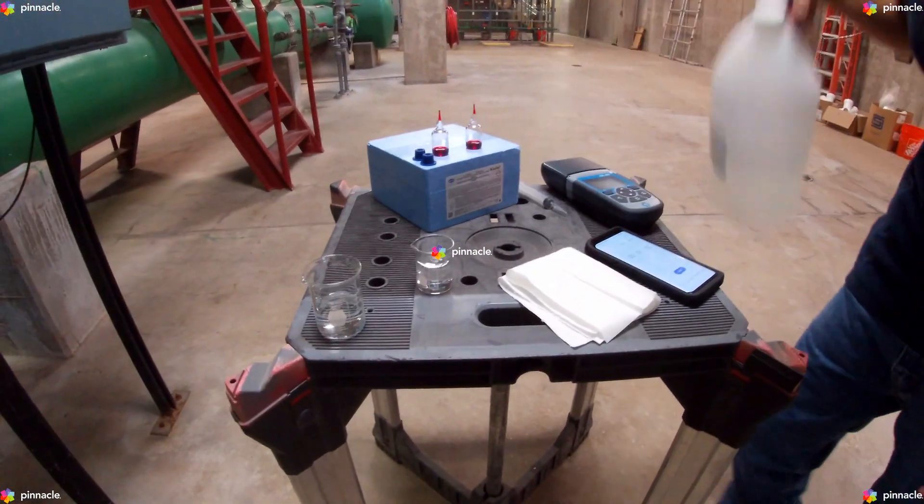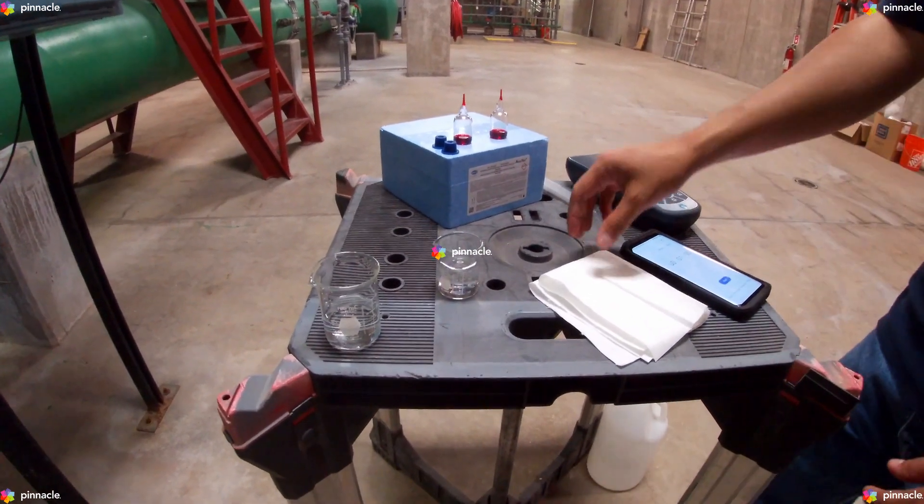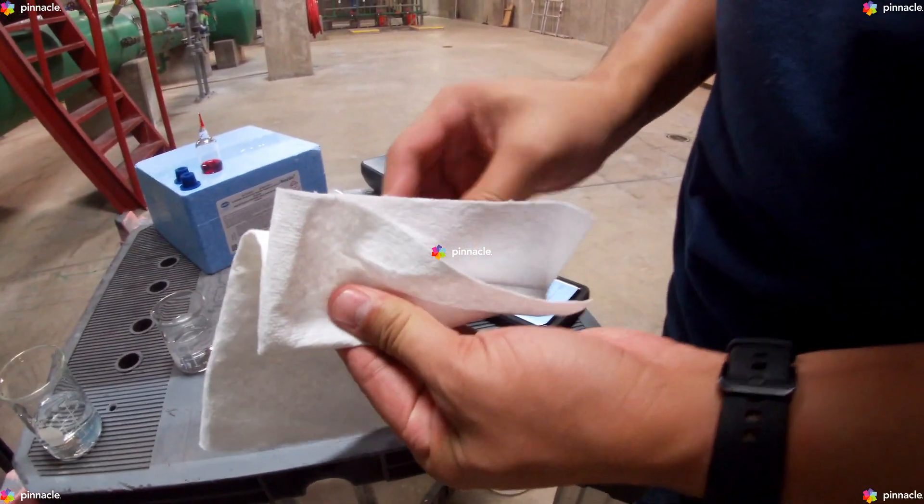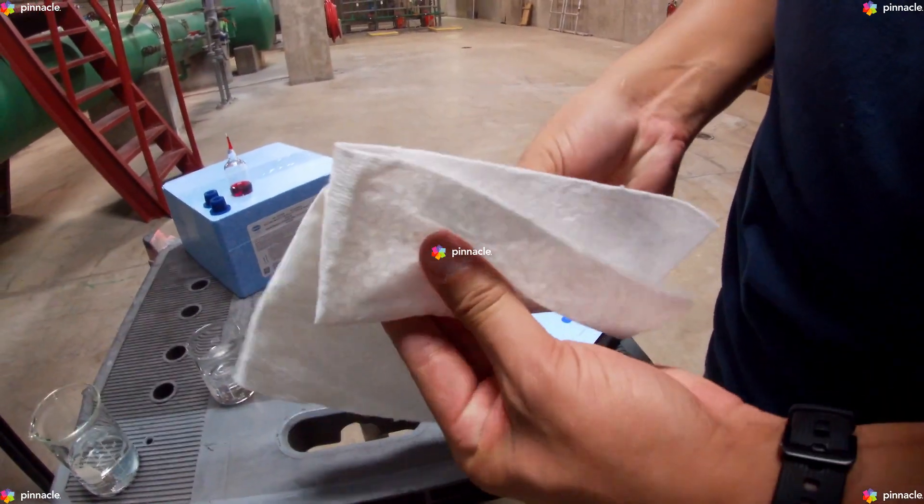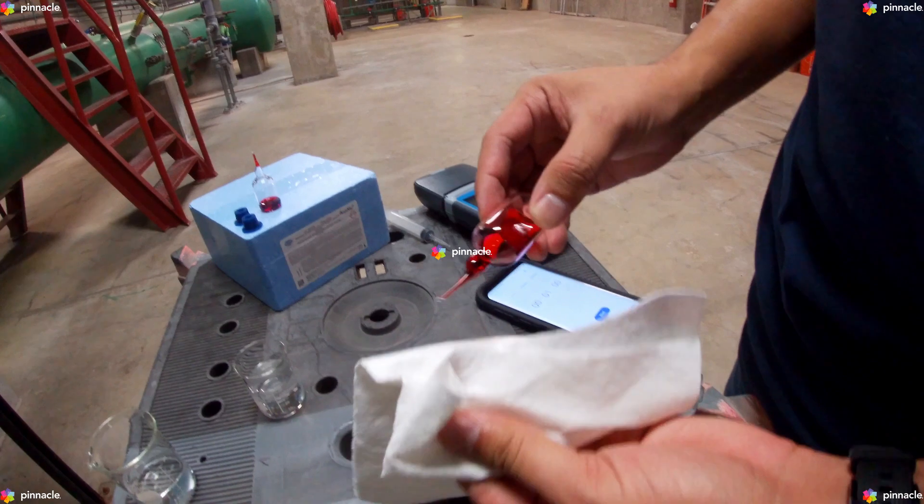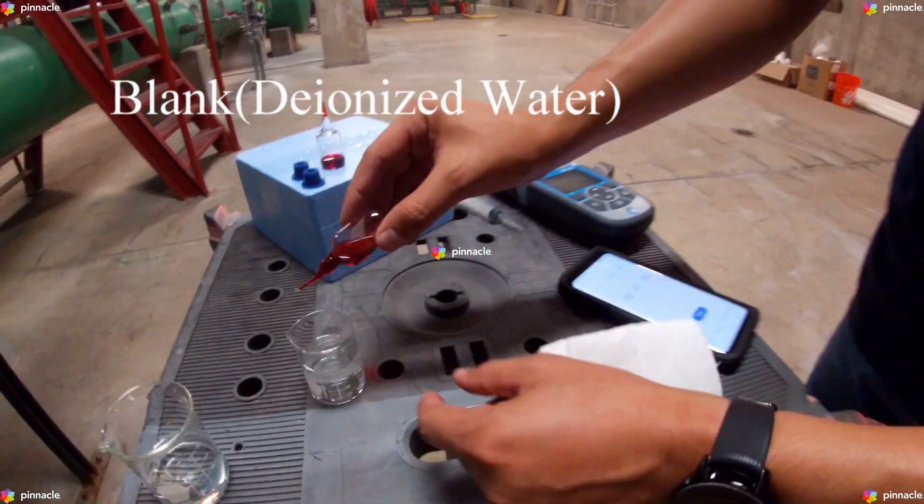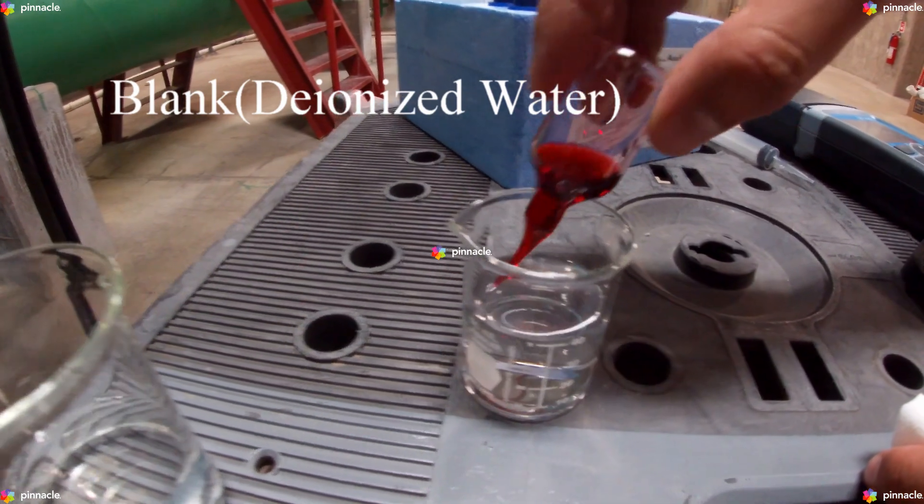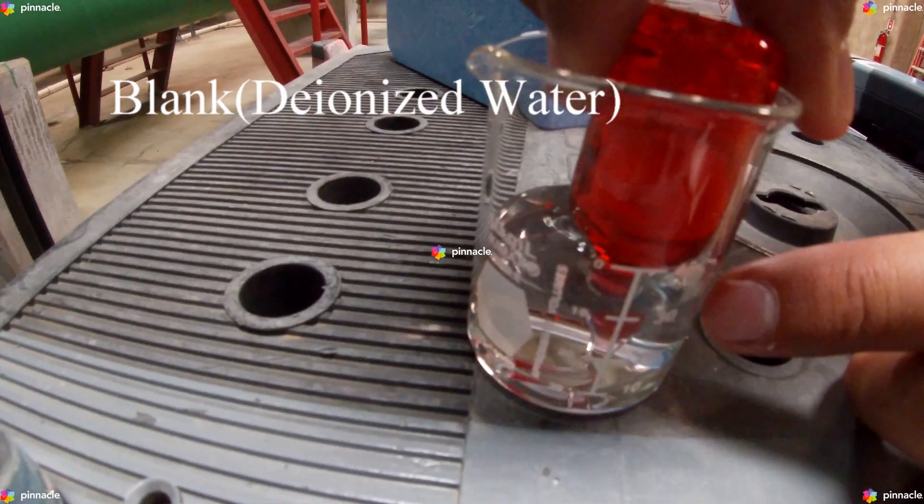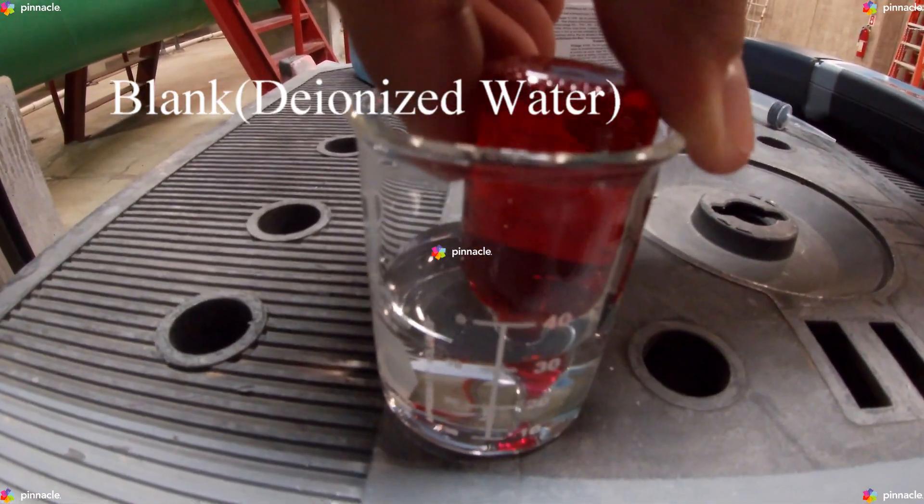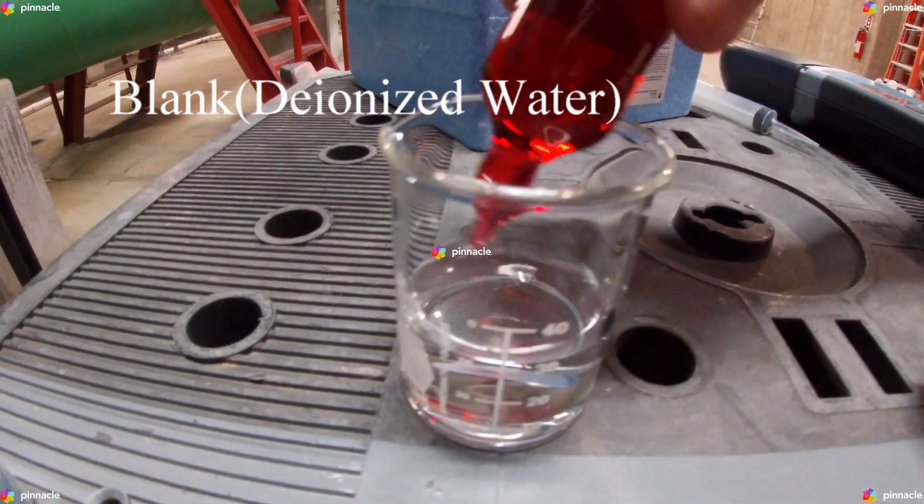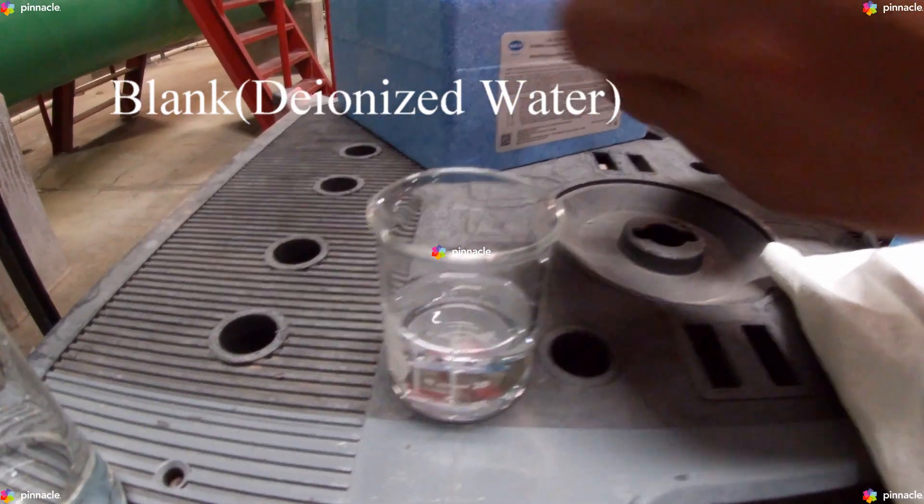We will then grab an AccuVac Ampoule and make sure to properly clean the surface and the tip before submerging into the beaker itself. We will submerge the tip of the ampoule and break the tape. Keep the tip immersed while the AccuVac Ampoule fills completely. We will quickly invert the AccuVac Ampoule several times to mix.